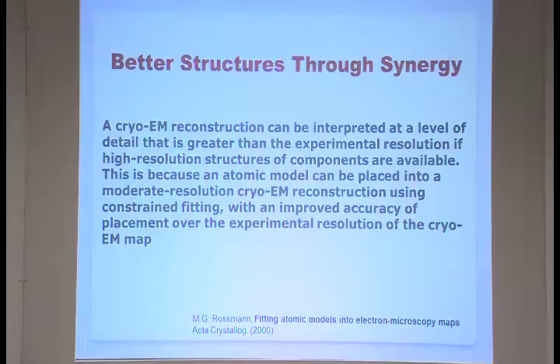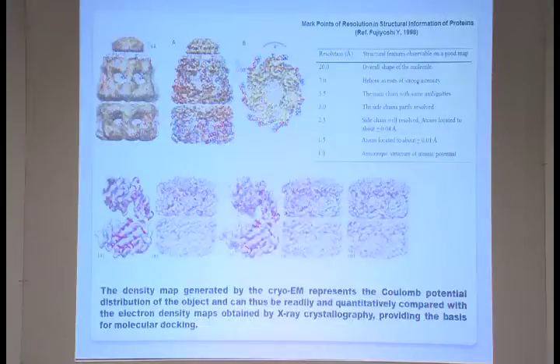If the resolution is, say, 17 angstrom, then the structure you mold into it has an error of about 1.7 angstrom, plus or minus. So the better the resolution, definitely the better you fit your structure.